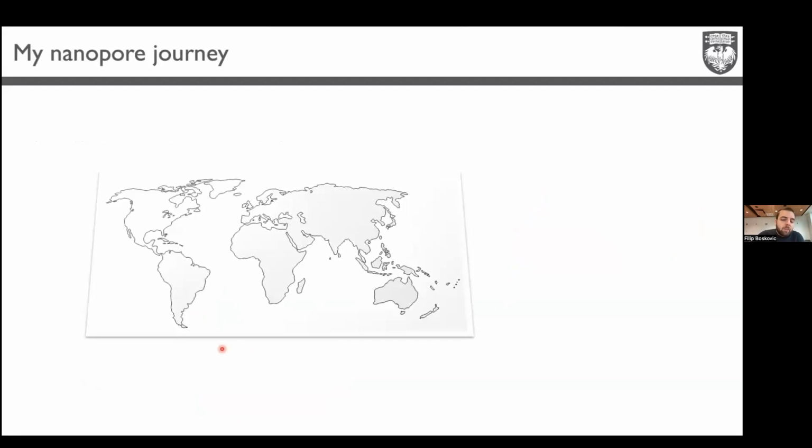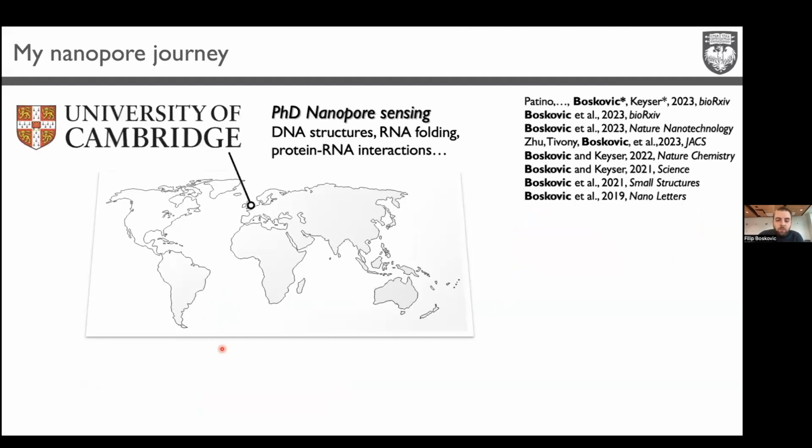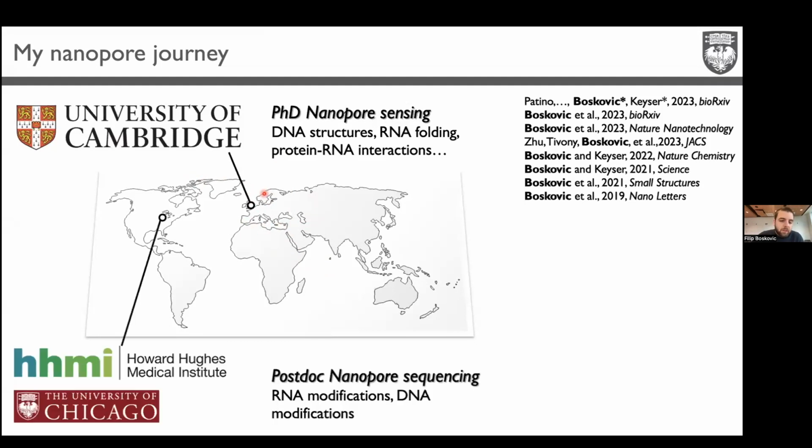Just to give you a brief background, because that would also affect my claims and beliefs in this presentation: I did my PhD in Cambridge, working in the Nanopore Lab, one of the founding nanopore labs. We were mainly doing nanopore sensing. You will see what that means, but we studied alternative DNA structures, RNA folding, RNA isoforms, and protein-RNA drug interactions in native molecules on the single-molecule level. For me, that turned out relatively productive, and I really enjoyed this nanopore journey. We also collaborated quite a lot with Oxford Nanopore Technologies, the company that Fatih mentioned.